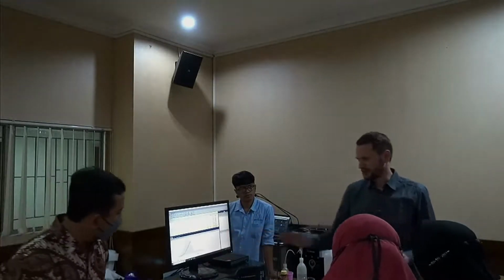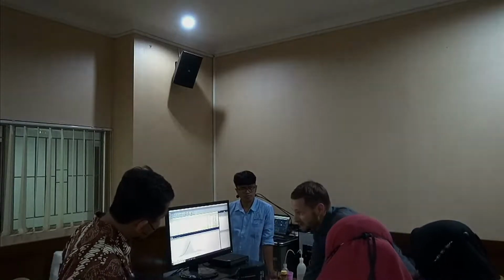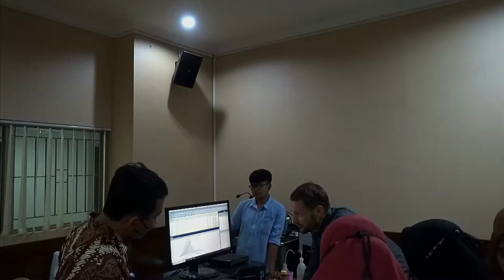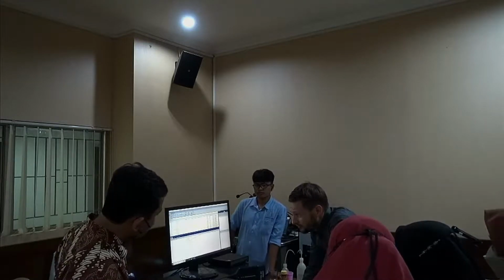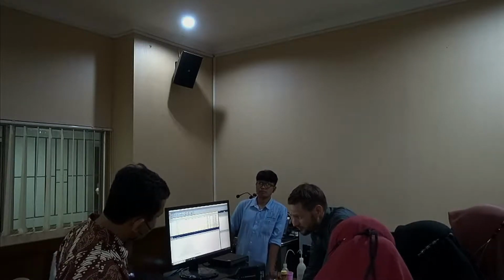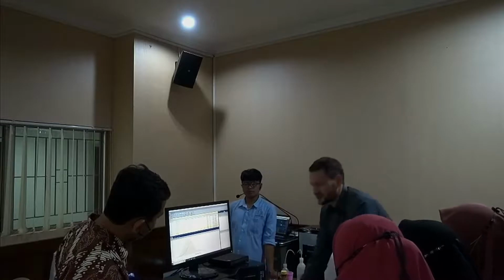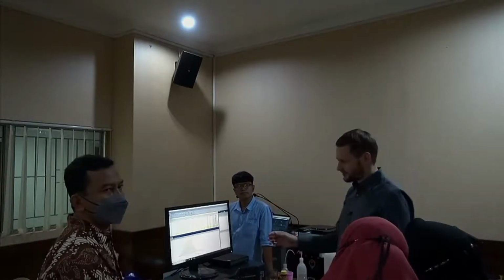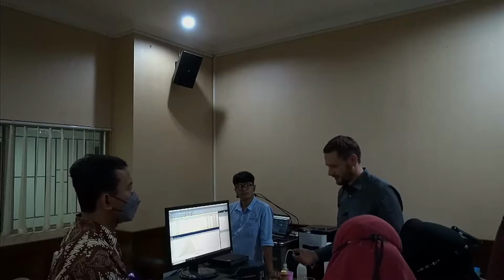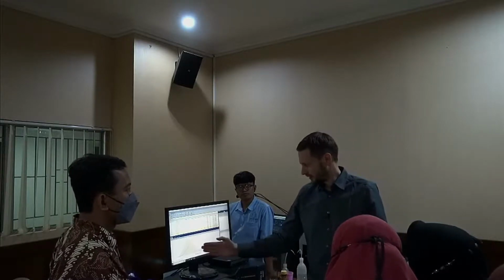Just slightly, I mean it's not big, but there seem to be more, and it's very systematic, because you can see with 100, it's quite reproducible, very reproducible. Also, the same goes without the ultrasonic. It's quite reproducible, but if we compare with and without, there's definitely a shift going on. So here, it's actually a very nice sample because it shows us that the setting of the ultrasonic moves our peak.